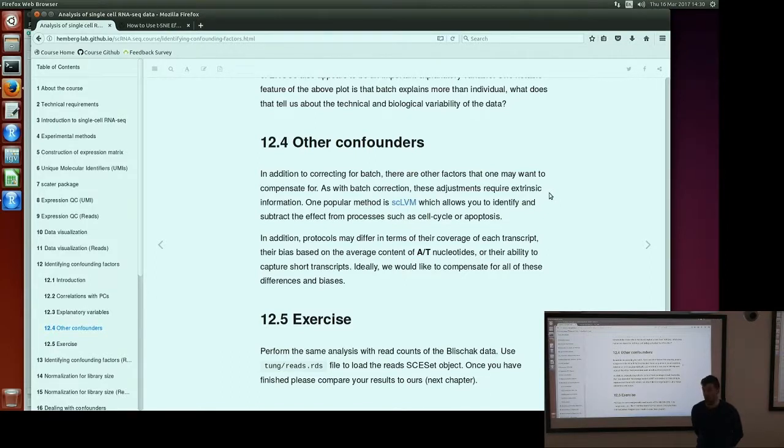There's the cyclone method from the scran package, also for cell cycle. And then I know the Pagoda package also has some approaches to trying to identify biological processes generally speaking, so going beyond cell cycle, that are active or prominent sources of variation in your data. That's not a formal latent variable model, although I know some people are developing formal latent variable models to address these things.